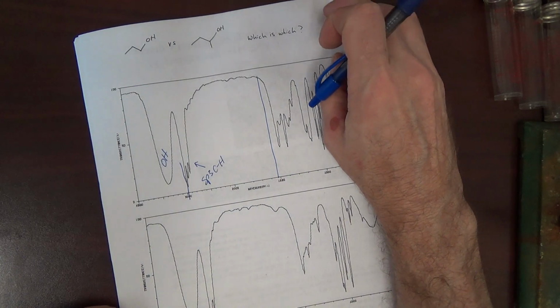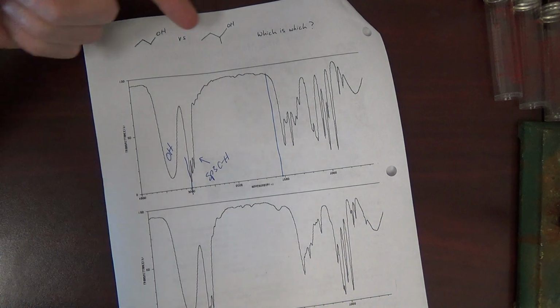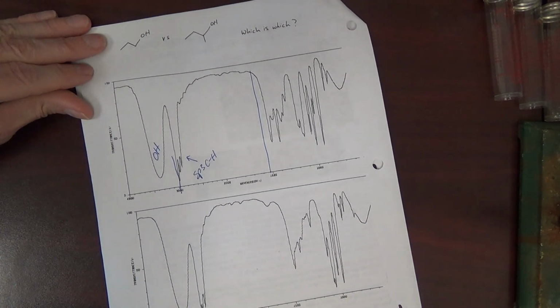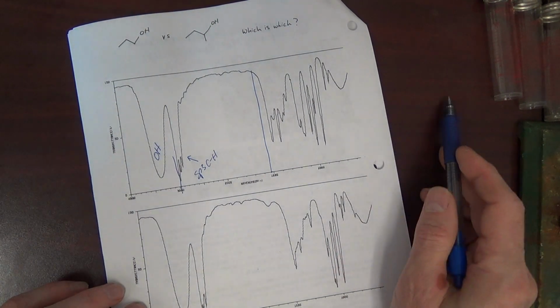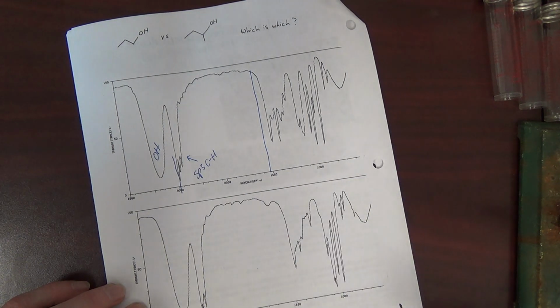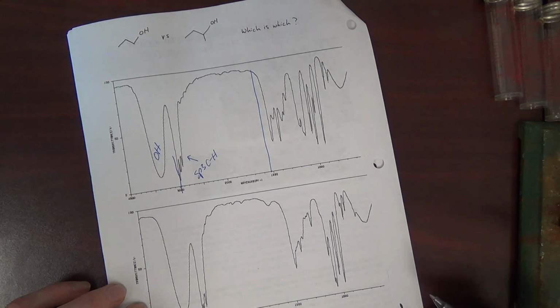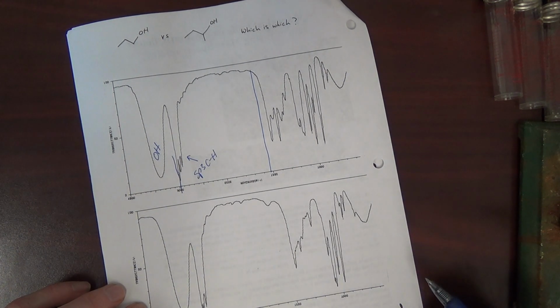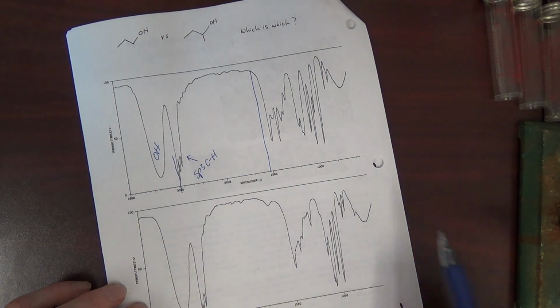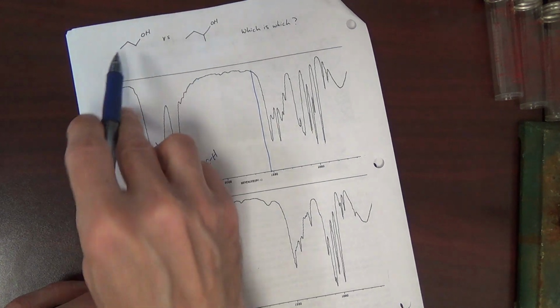If we had some known IR, like if we took these two compounds and ran an IR of each of them, well then that would give you your answer. Or if we could find a known IR for one of these and see which one it matches, then we can use the fingerprint to match it up. But as is, it's impossible to tell, and this shows a limitation of IR. Both IRs show some functionality here, but we cannot assign each IR to each compound.